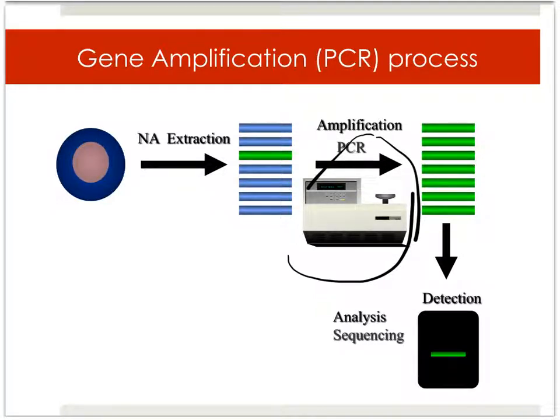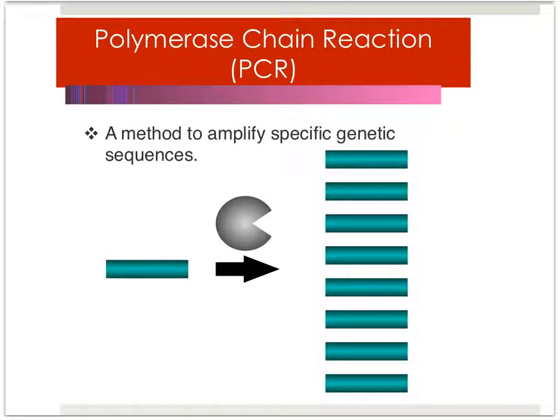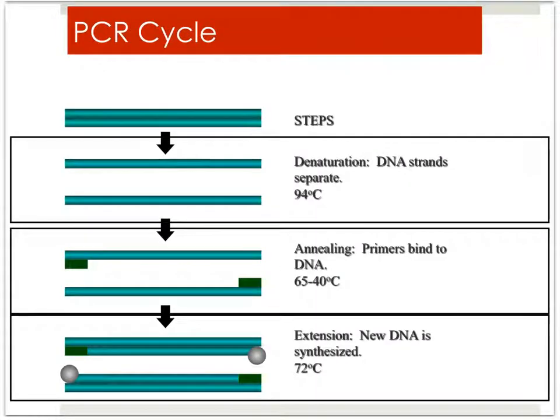And once you amplify that gene, you can detect it visually using a gel at an expected size, right? Many of you are familiar with this. And then you can do further analysis. You can use it for sequencing, for cloning, other purposes, or specific genotyping to answer an epidemiology question, okay? So we'll look at it step by step, but again, this is just the same concept here.